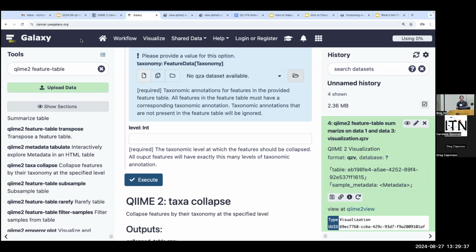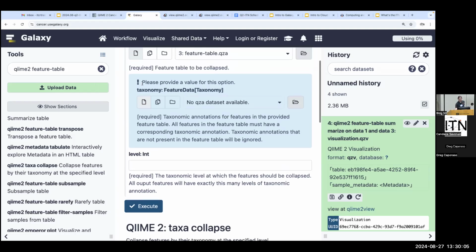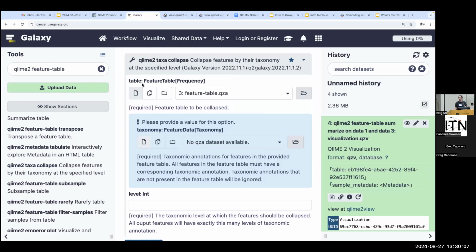And so it's like when we run these little steps, we notice how long it's taking, the overhead of using this. When we run bigger jobs, that overhead becomes negligible. And it's like you would hit it, and then maybe you're going to go out for coffee and come back in an hour and check on whether it's done, or you're going to start a job over the weekend with the hope of coming in on Monday morning and getting your results. And one feature that we didn't look at, but is pretty neat with Galaxy, is you can have it send you an email when it's done. I think you need to be logged in for this. That way you can just be alerted, get that information.